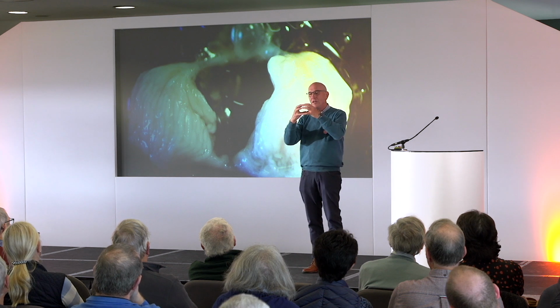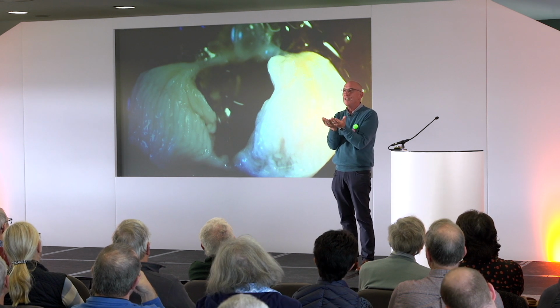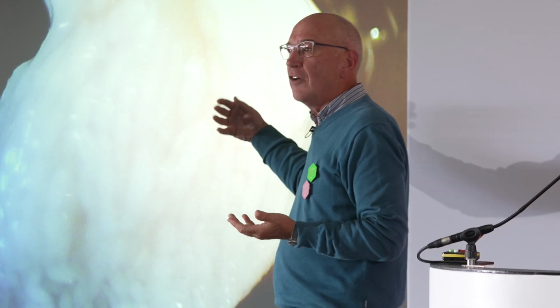So you can see it and you can imagine it. It's much, much better than seeing a picture for being able to understand. But then the hard bit is making up an anatomy slide for you to present that and to be able to imagine it. Because what you have to do, you have to stain it, you have to dry it, you have to put it in a medium which makes it durable and can last.